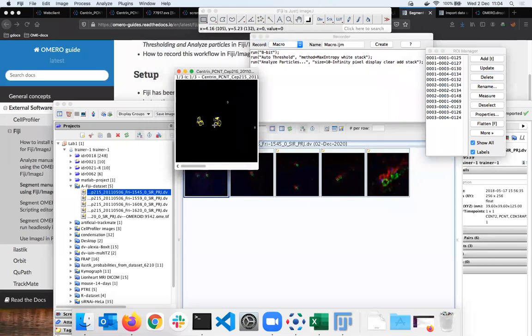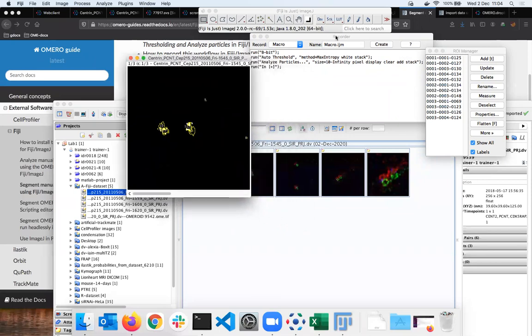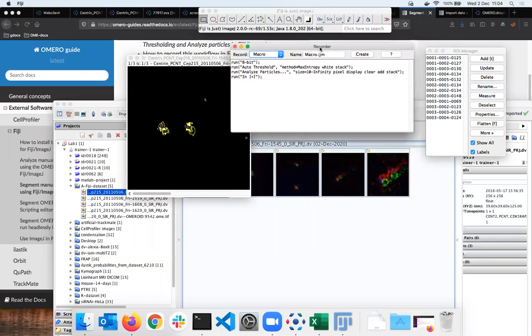And you can see that I have created some interesting regions of interest. In Fiji, they look already much better than the funny region I just drawn by hand. And I have 3-channel image. That's why you can see the slight mismatch, because the ROIs are in all 3 channels. And now I can simply go and save the ROIs in OMERO that manually. That would be nice, but ultimately not that interesting, because you already saw how to save ROIs into OMERO manually. What if I want to go a step further and do the batch analysis, which I was preparing my guns for here with the recorder?